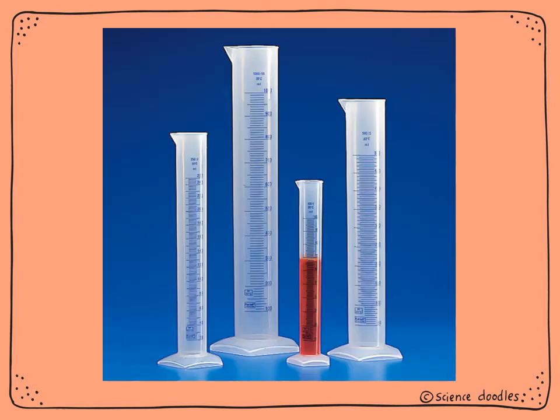And here are some examples of different graduated cylinders. You can have really skinny ones, you can have taller, wider ones, but notice that all of these are much, much skinnier than the beakers and also taller. It also has the markings on the side to figure out how many milliliters you have.